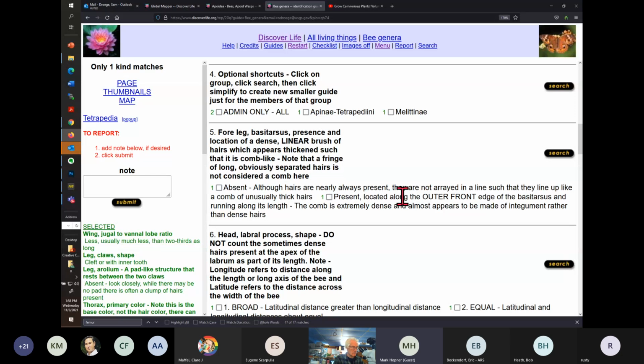I'm not sure it's visible here. I'm not sure if it is for this species in general. We've just never pointed out that character before. Okay, yeah, this is one that I think the Paratetrapedia and Tetrapedia have, and maybe a couple others in that group, which are not ones that we have in the East.